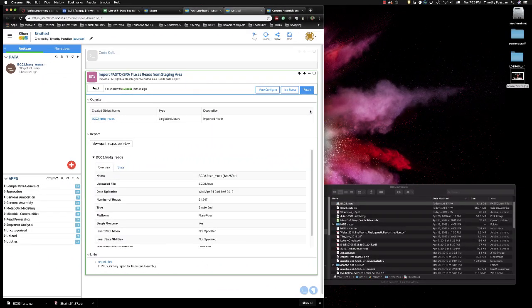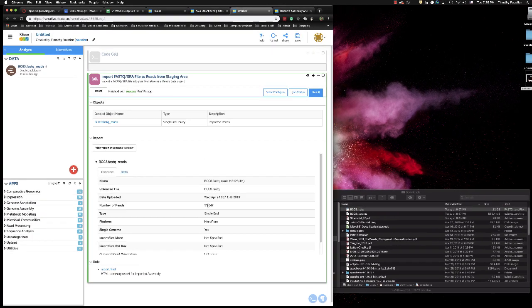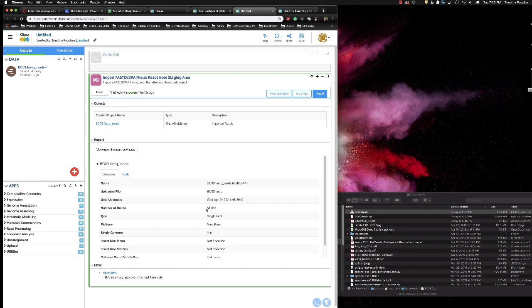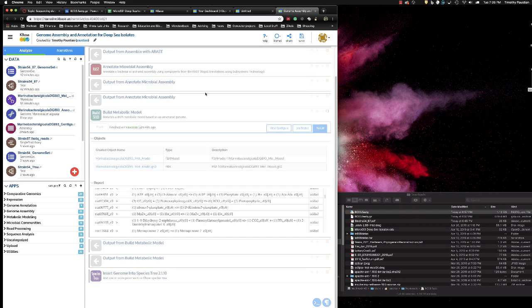Our FASTQ file has now been brought into the staging area. We can now go on and start to do our analysis. And you'll see here that it's got 51,000 reads in it. That this is a nanopore read. So we're going to shrink this down.